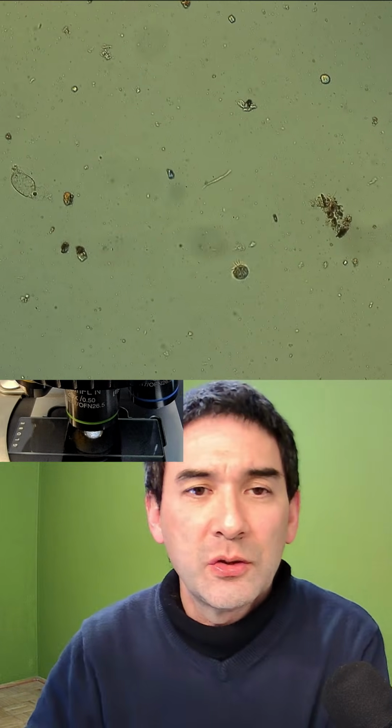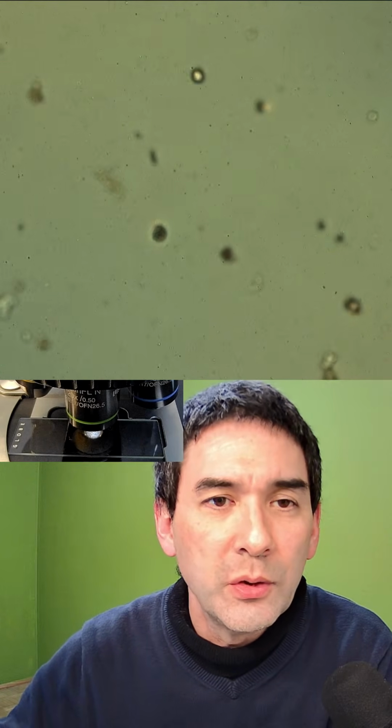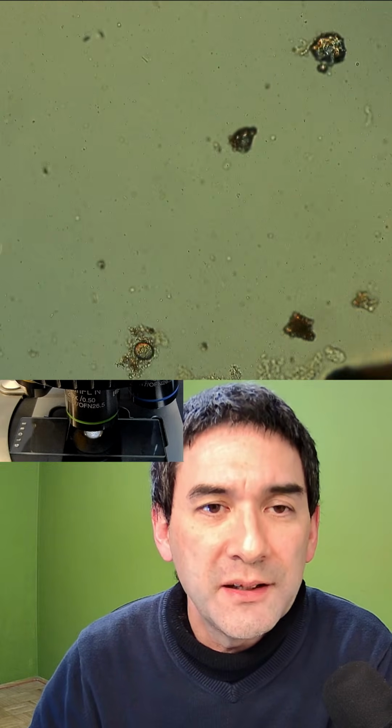We occasionally like to explore things. However, those slides, even though there is some nice, interesting movement going on, don't always look as pretty as some other ones, especially plant cross sections. For this reason, I decided to have a look at a few of my other favorite slides, and then take it from there.